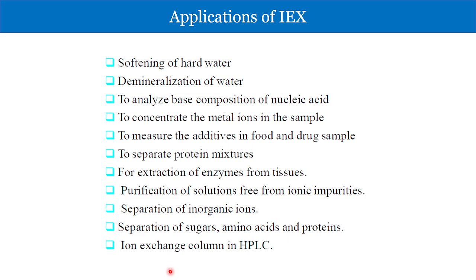So let me give you one example. If you have two 10 kilodalton proteins in a particular mixture, and your protein of interest is also of 10 kilodalton size, you definitely go first for an affinity chromatography if there is a tag, or go for an ion exchange if you know that your protein has a charge that is different from the other two proteins of the same size. If that is possible, go with that first. But if you simply go for size exclusion chromatography first, it's of just no use. Everything elutes at the same place, and then the entire effort goes in vain.